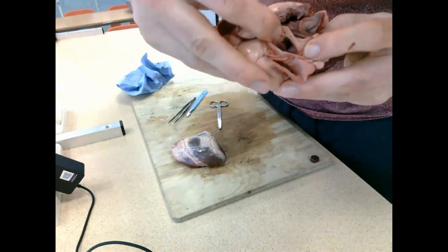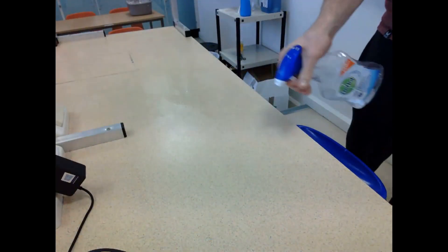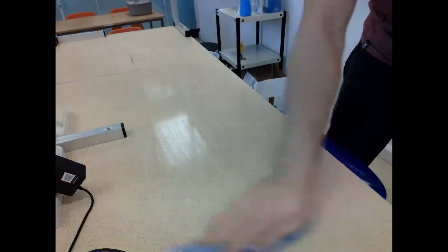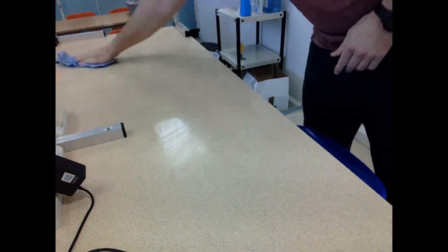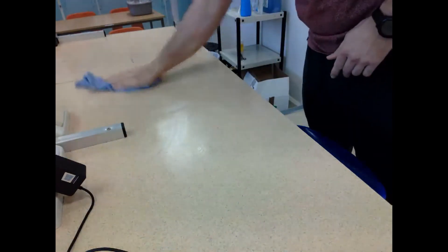I'm again trying to show the semilunar valve, but as I said, they can be very hard to identify. Once done, I disinfected my desk again to ensure it was ready for the next experiment or person to use - we don't want blood left on the desk as that wouldn't be sanitary or fair on the next person.